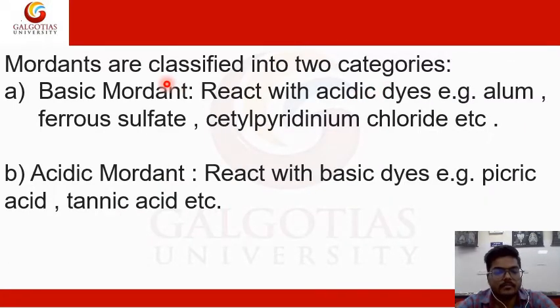Now there are different terms, like mordant. What is a mordant? The work of a mordant is to make a close bond between the sample and slide, and the sample and stain. So mordants are used for that. For example, in gram staining, the mordant is iodine.